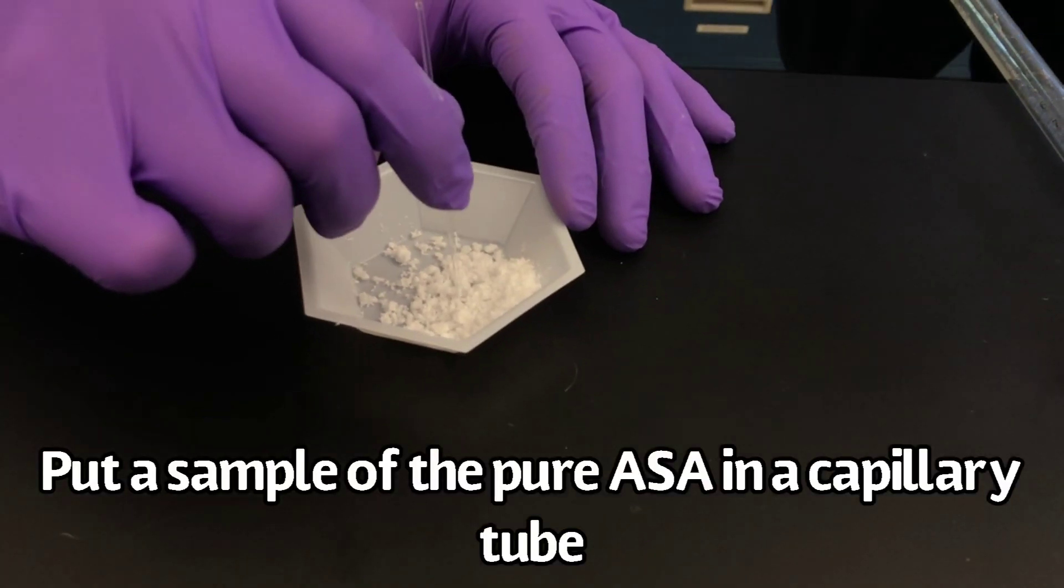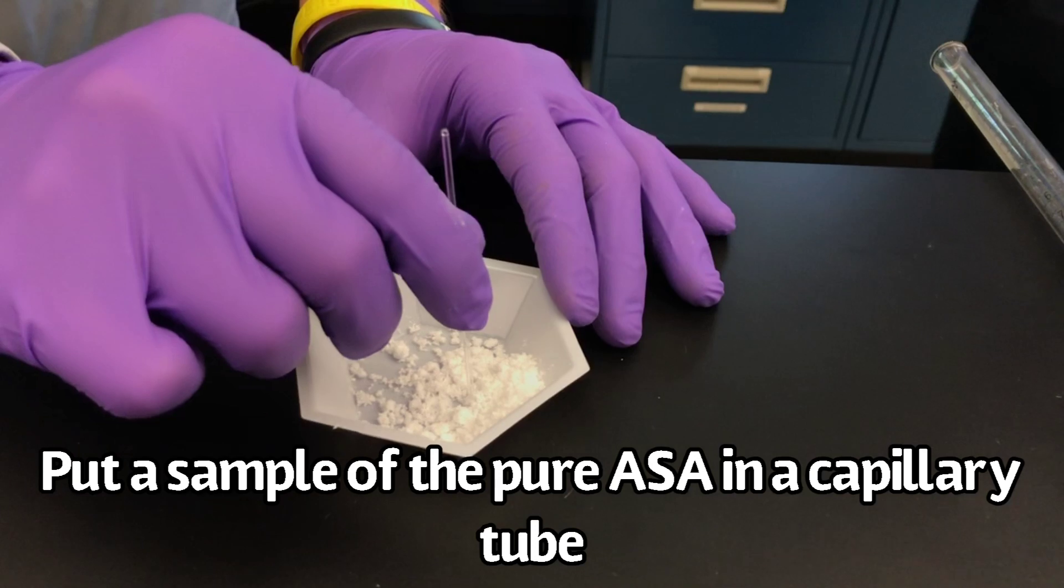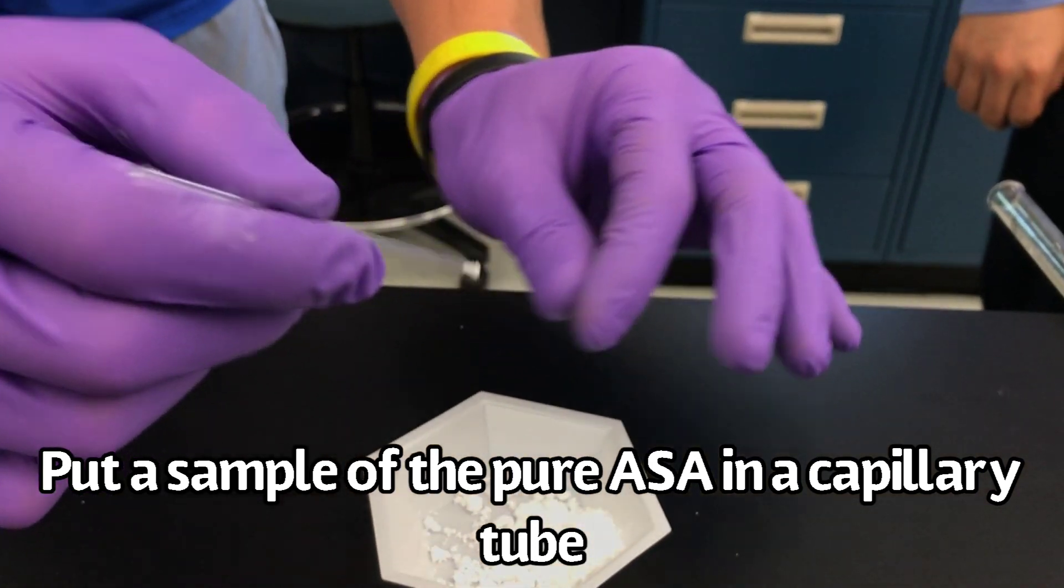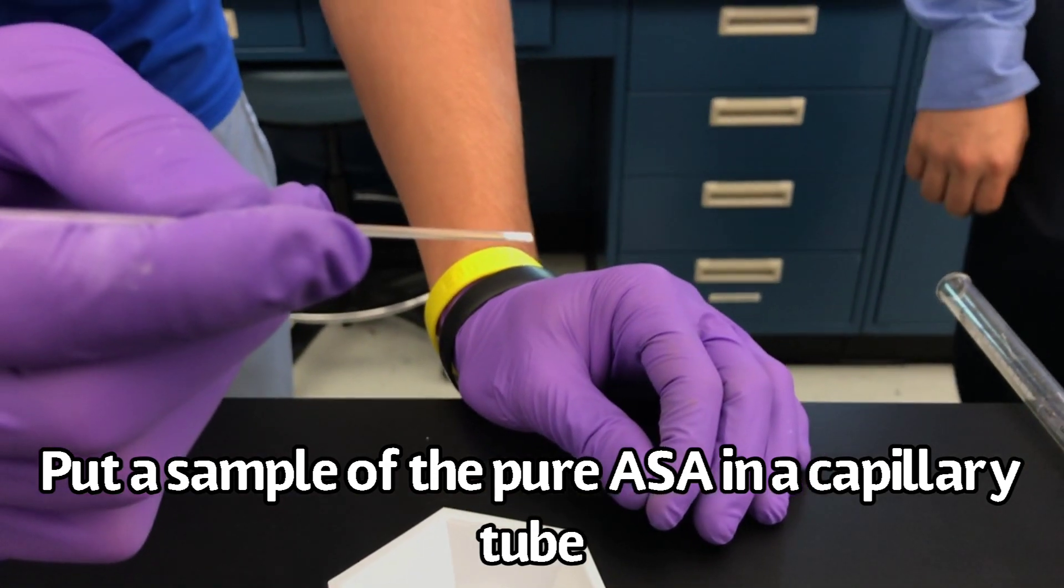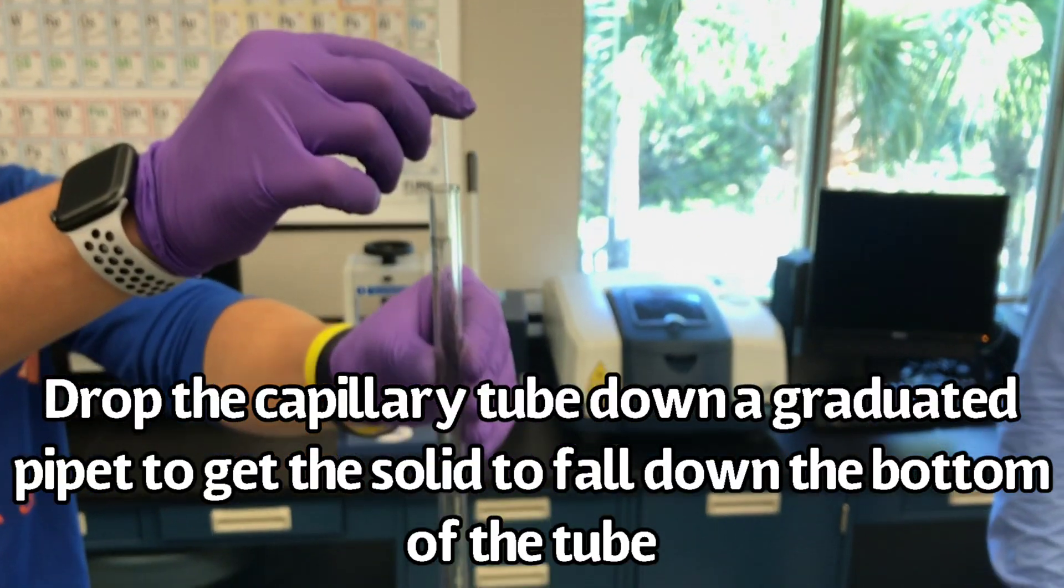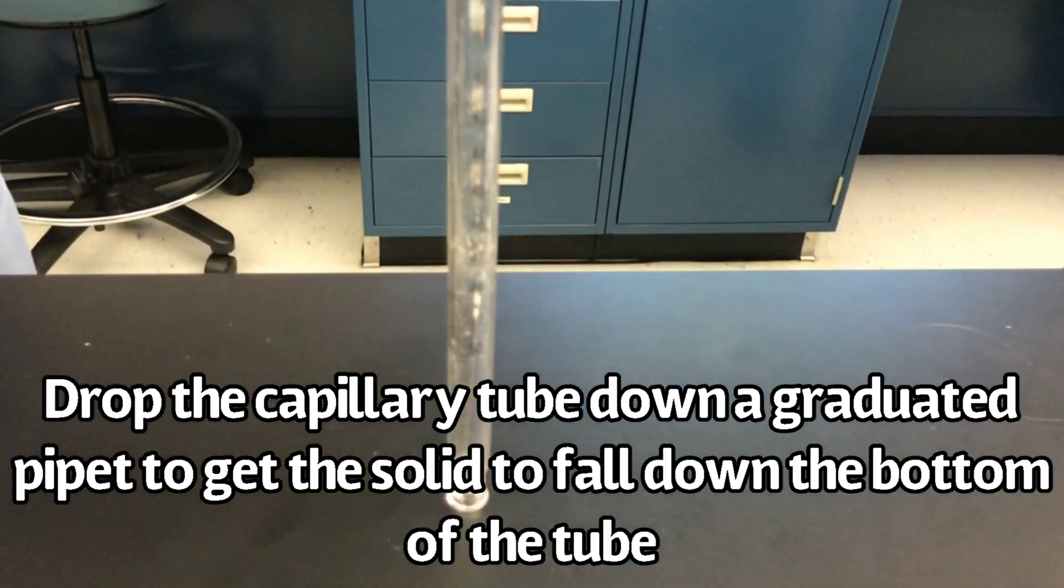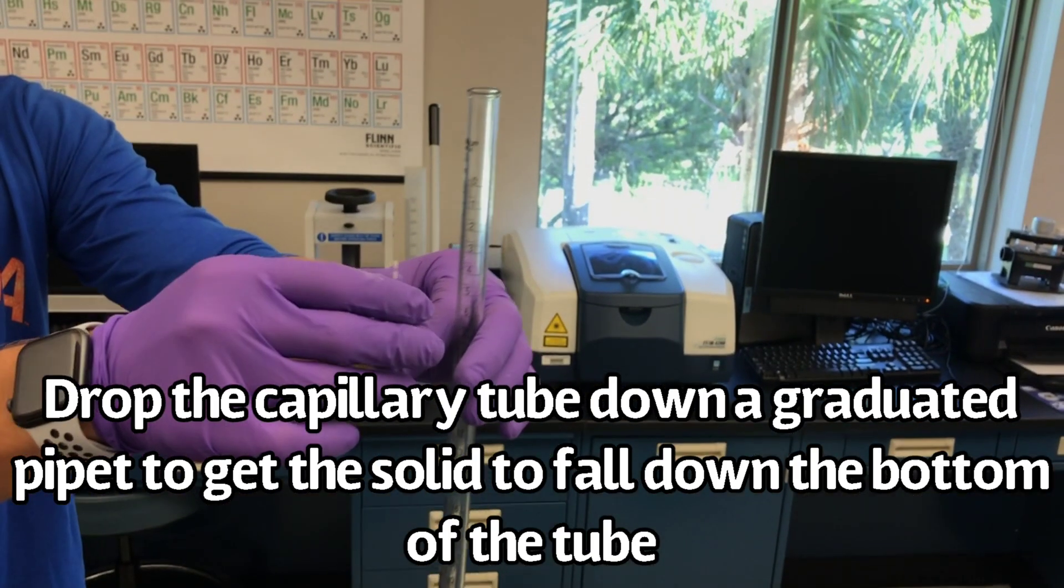Put a sample of the pure acetylsalicylic acid in a capillary tube. Drop the capillary tube down a graduated pipette to get the solid to fall down to the bottom of the capillary tube.